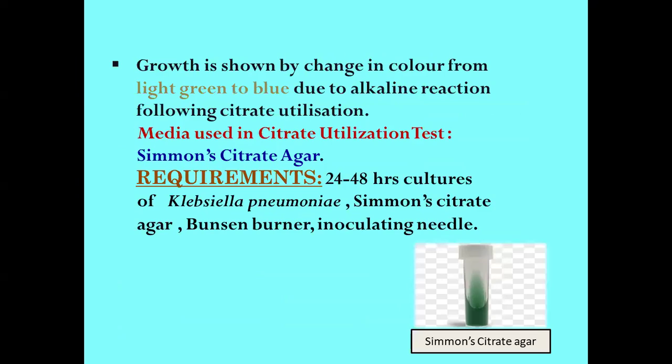Now the growth is shown by a change in the color from light green to Prussian blue, due to the alkaline reaction. What is that chemical reaction? I'll explain in the next slide. The medium we use here is Simmons citrate agar medium. The general requirement is a 24-hour to 48-hour old culture of Klebsiella pneumoniae and Simmons citrate agar medium, which lacks glucose and has only citrate as the sole source of carbon, plus a Bunsen burner for maintaining aseptic conditions and an inoculating needle.